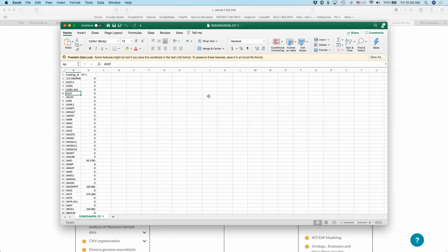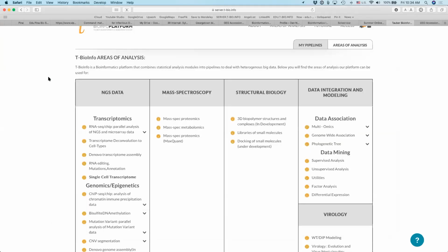And the expression of that gene ID is going to be across different columns. Once I have a table like that already prepared, I need to make sure that the correct identification is placed in headers. And then I can actually process that data in the ways that you're describing.